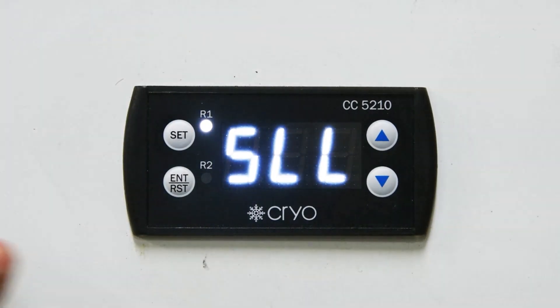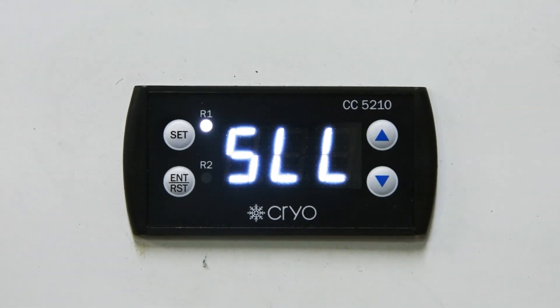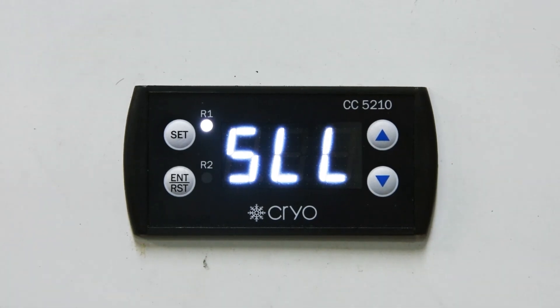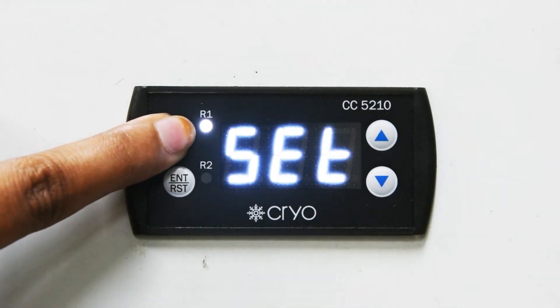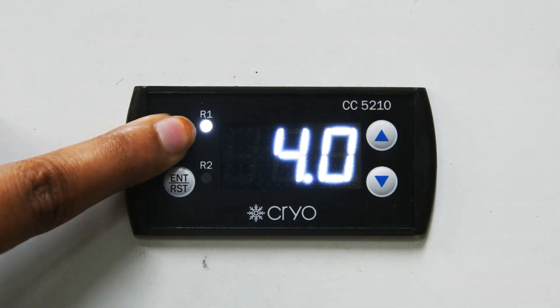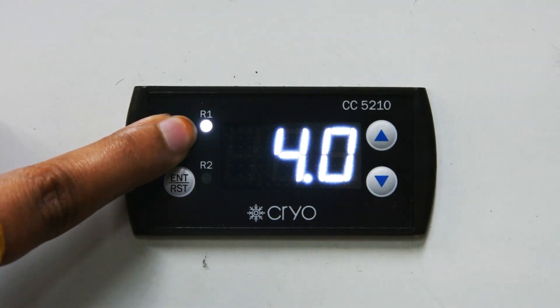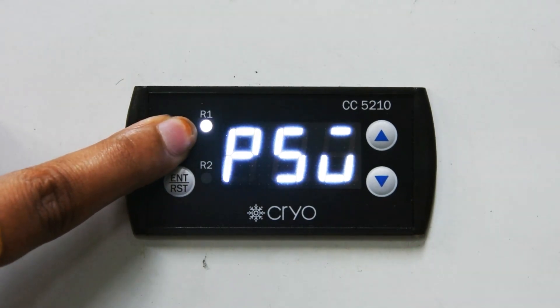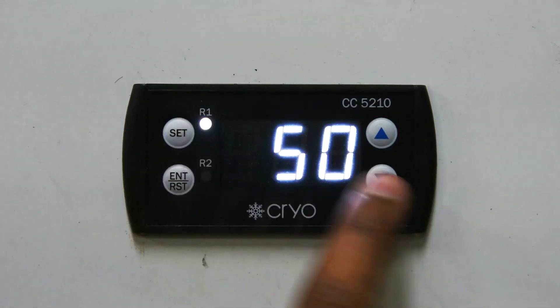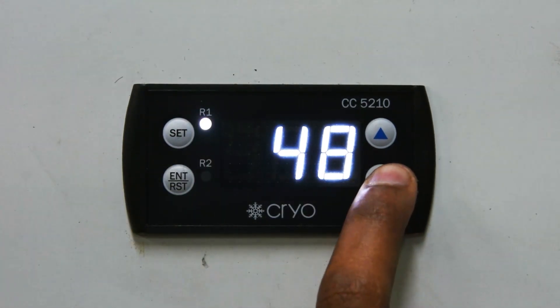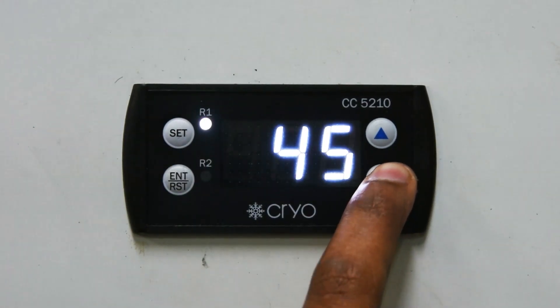In this controller there are two sequences of settings. We have checked the first sequence using password 69. Now we will check the second sequence of settings using password 39. Again, press the Set button continuously for 5 seconds until it shows P50, then decrease the number to 39 to check the parameters.